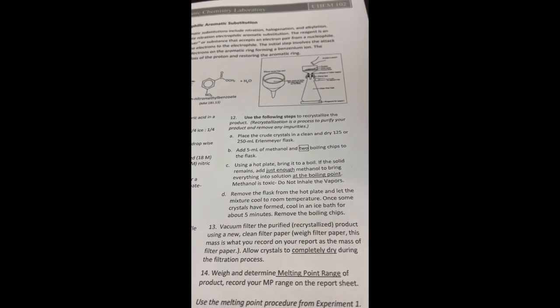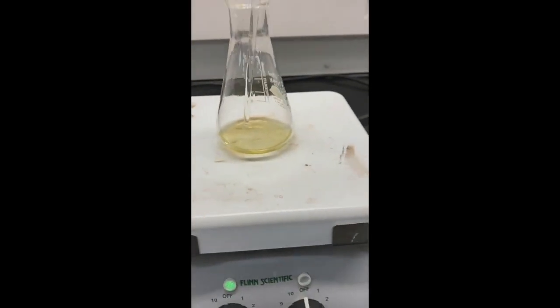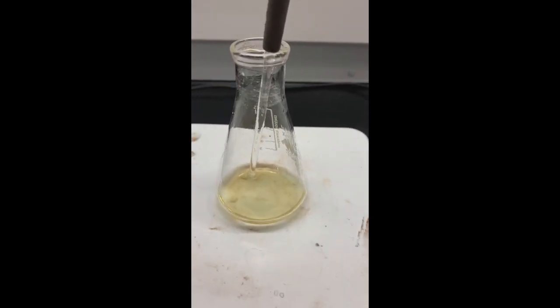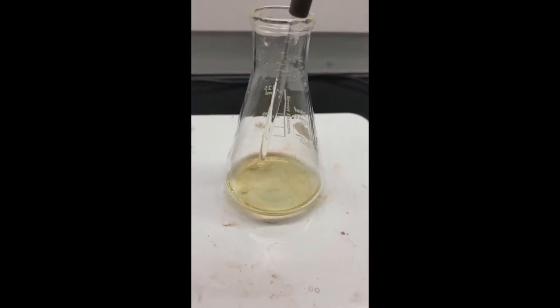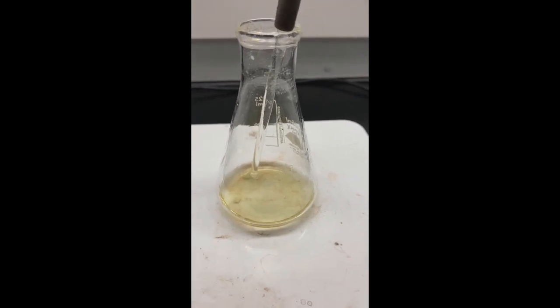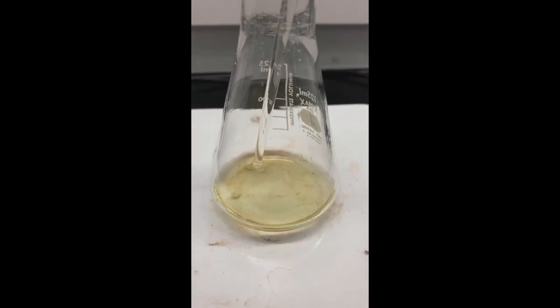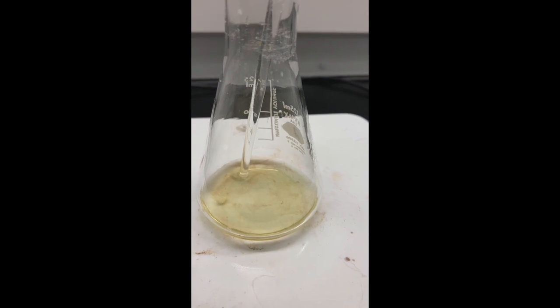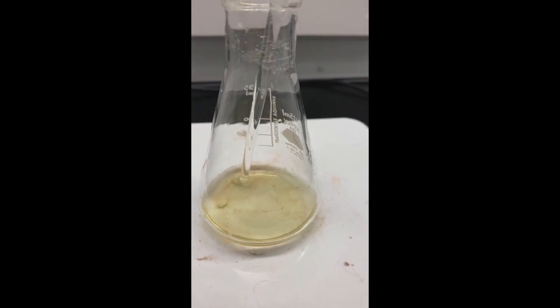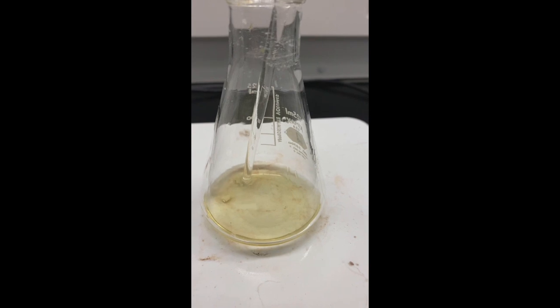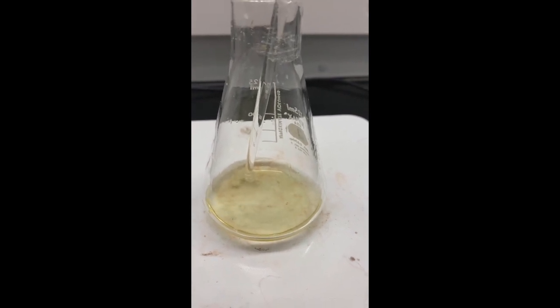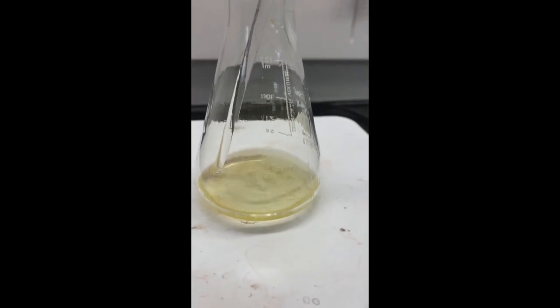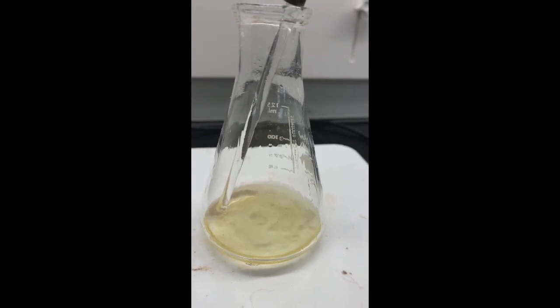I'm on the recrystallization step. I have now put this back in the hood because I want to make sure any fumes that are given off are captured by the hood. It looks like I have my two bowling stones in there. I was able to dissolve all the crystals. The idea behind recrystallization is you take those crude crystals, you put them back into solution, and any impurities that happen to be trapped in the original crude crystals are now gone from that. So when I take this and I make them crystals again, hopefully what we're going to see are nice pure crystals, and we're going to prove it by taking the melting point. Pretty good demonstration of how a boiling stone works. The only two solids in there are the boiling stones, and you can see that it gives you a nice smooth boil.